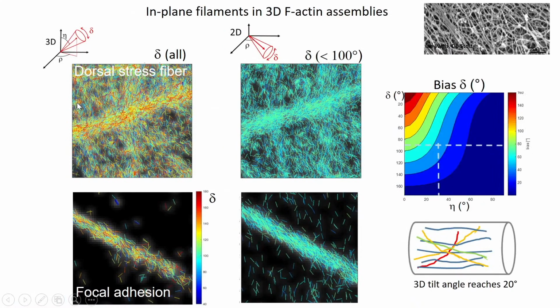The reason for this, as we understand it from analysis, is that these little molecules here that you see as highly wobbling ones are actually biased wobbling measurements from highly tilted molecules. As I said before, we do reduce the numerical aperture to provide a selection of molecules that are lying in plane. However, it's not a 0 to 1 filtering, so we can still observe some molecules with some degree of off-plane orientation.